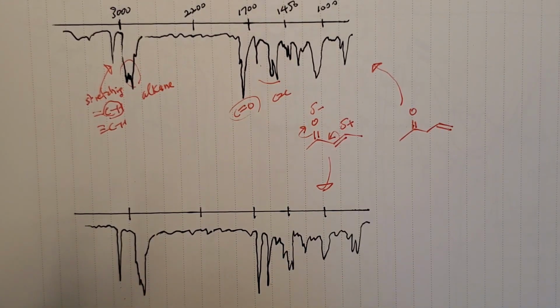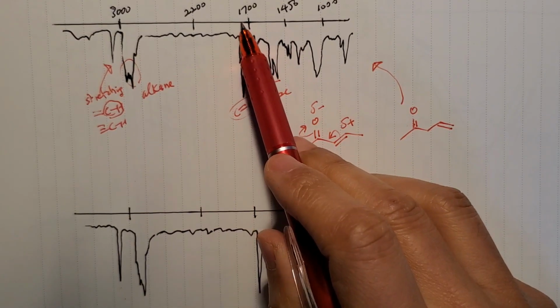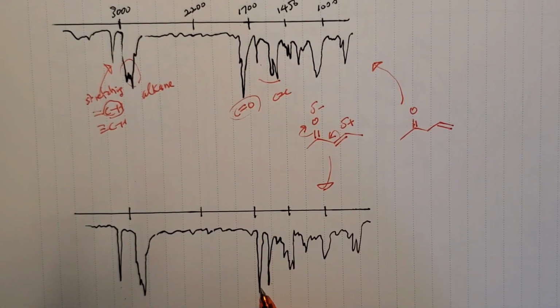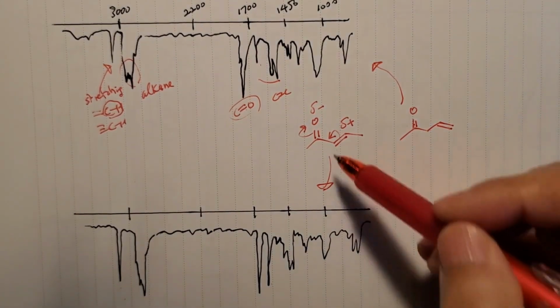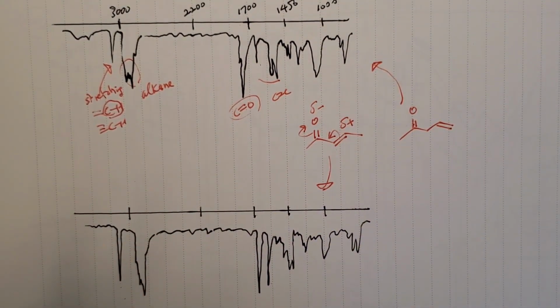So it makes sense. Without resonance, it was a higher frequency, now it's a lower frequency. So that resonance also fits this spectrum better. That's one type of variation that can happen, changing the intensity, the Y value, and the X value.